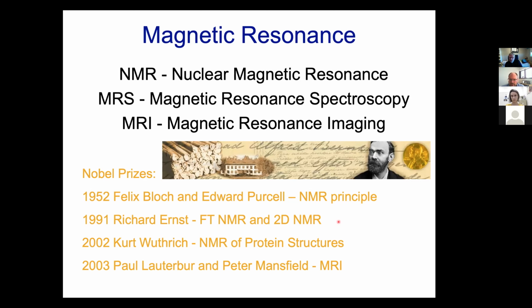In those days, it was two-dimensional NMR, but these days, everybody does three-dimensional NMR, four-dimensional NMR, and some people go even to the fifth and the sixth dimension, which is a bit weird if you think about it, because the world around me is just 3 dimensions, right? Yeah, but for a computer, it doesn't really matter. You can create a 4-dimensional, 5-dimensional space and work in that.